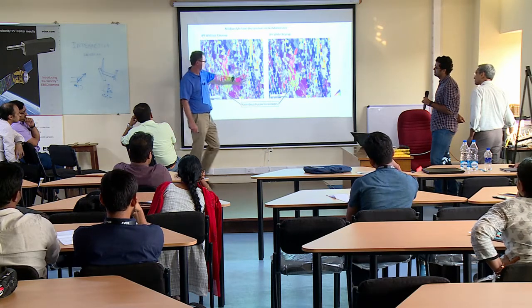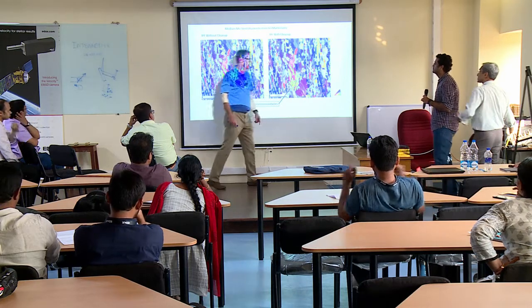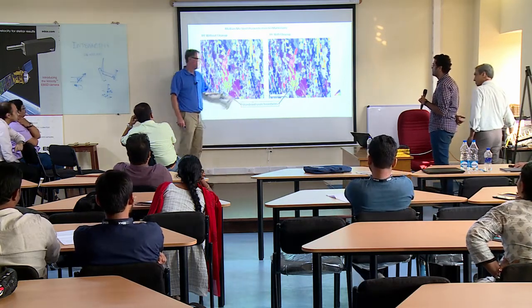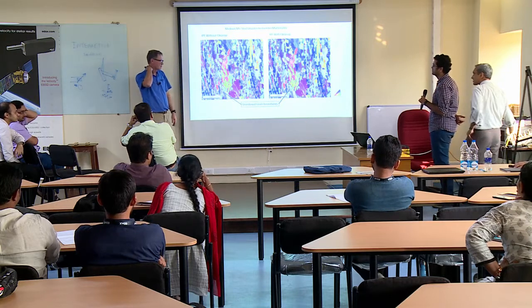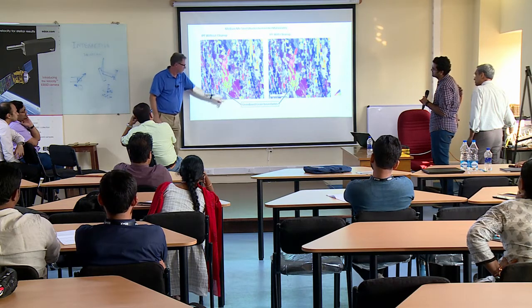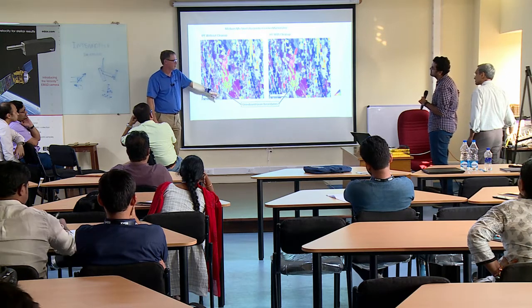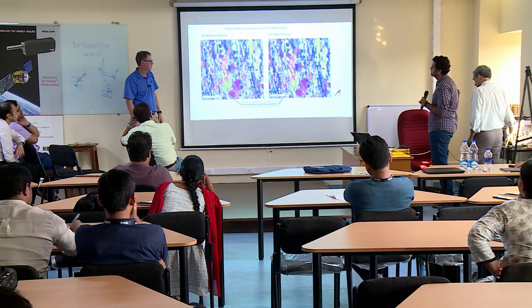So I think you've done a good job here because you've retained this problem here. Do these have low CIs, I assume? Yeah. Yeah, okay. So, yeah, I don't think you're quite right in calling this unindexed grain boundaries. I think this is a bigger region than that. I think there's a precipitate or some other phase.